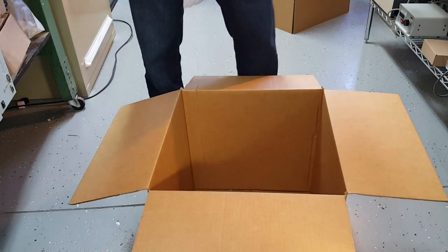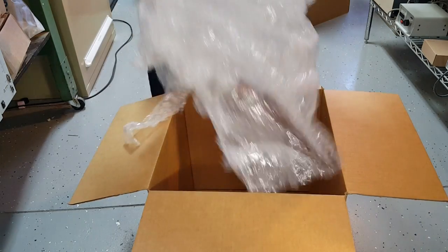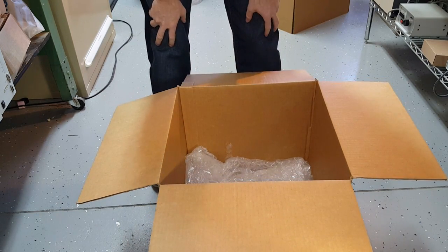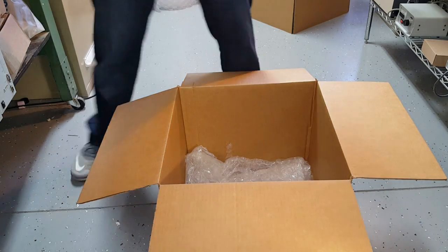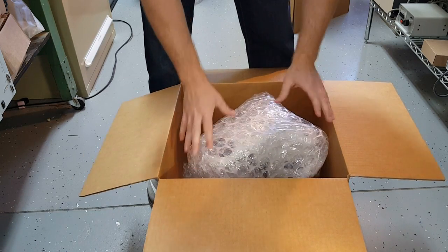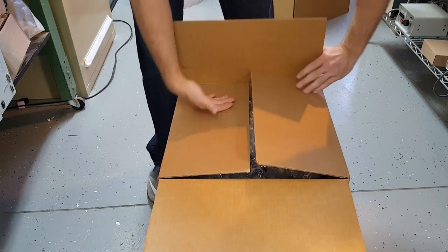Now we're going to properly box the microscope stand. We use a 16x16x16 cube. Line the bottom of the box with very thick — probably 2 to 3 inches — of bubble wrap or foam. Insert the stand and pack around it so the microscope does not move, using bubble wrap or packing peanuts. Then secure the box.